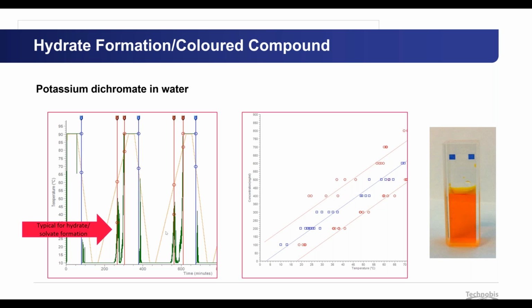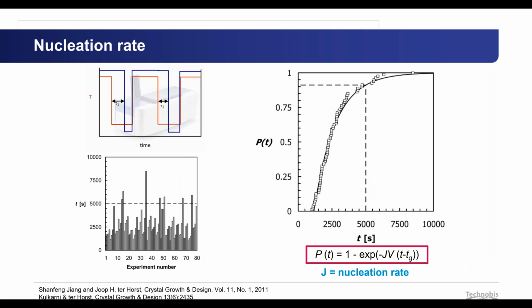If you have more questions, you can send us an email, and I can share more with you related to this. Very fast going to nucleation rate and induction time measurements. There were several groups busy in the last years on defining a method for induction time measurement.